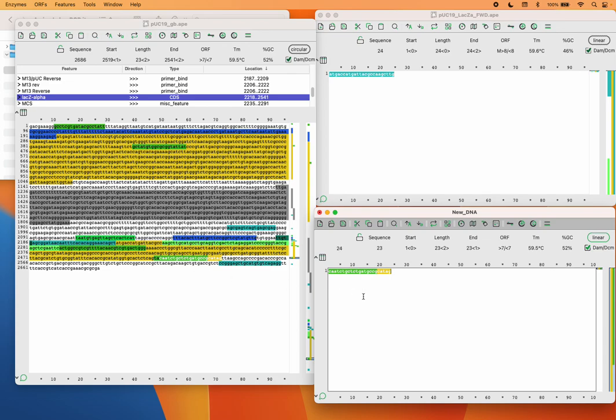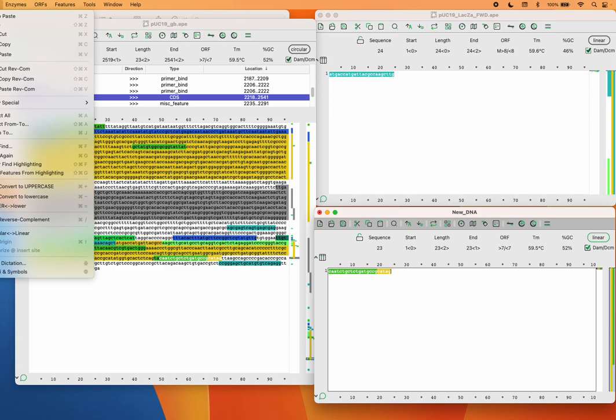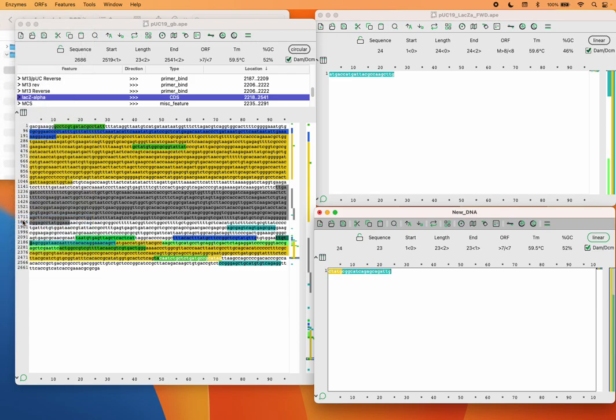And in order to do that, you can use a very simple feature where you go to the Edit menu in the toolbar above, and you go down and you'll see reverse complement. Okay, so I'm going to click on that, and you'll see this sequence change. There we go.